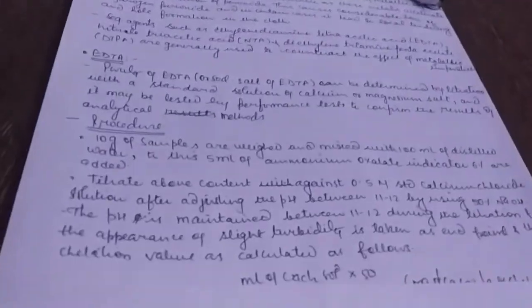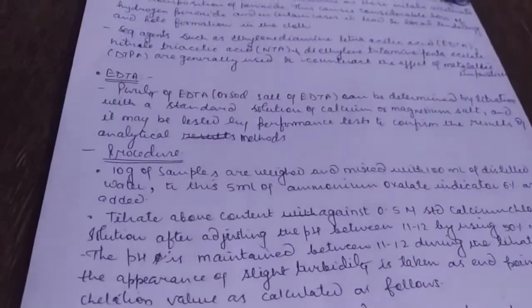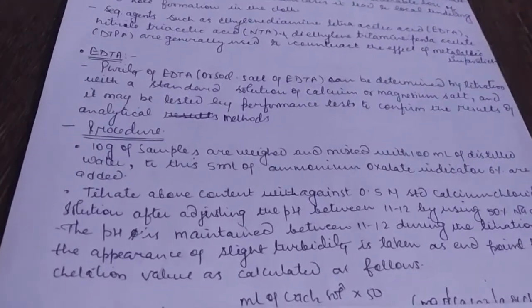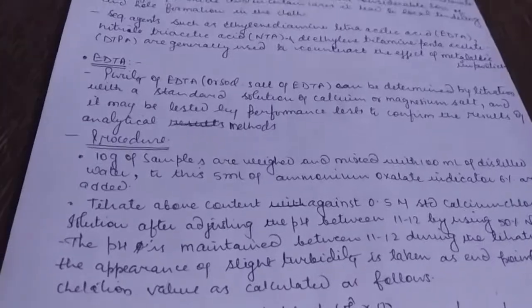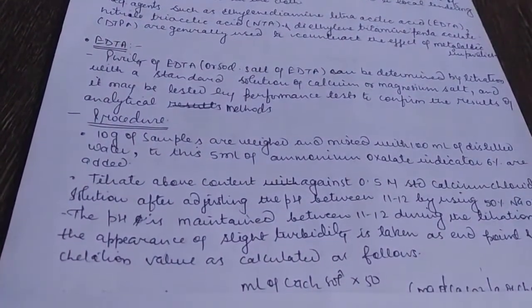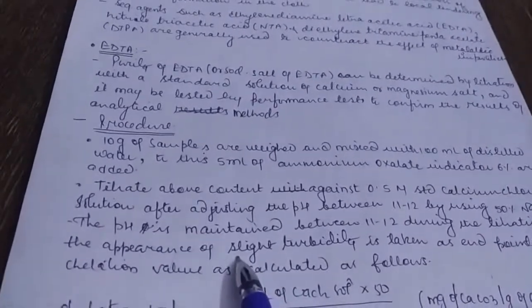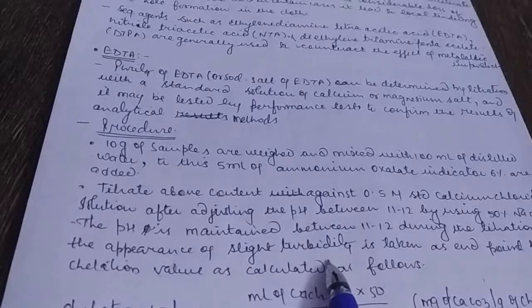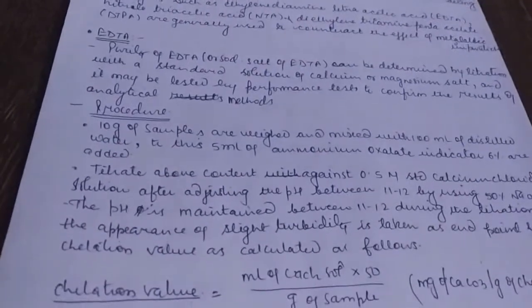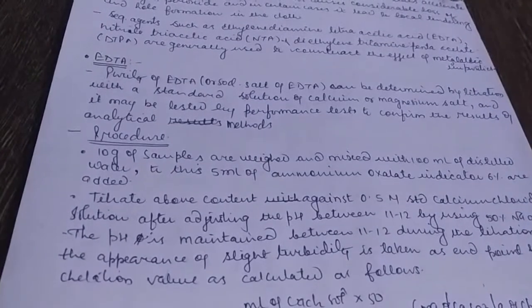First you should carefully identify the end point, where the titration should be stopped and we can say the titration is completed. That is, the solution turns turbid. So you should titrate until the solution turns slightly turbid, and then note the volume of calcium chloride consumed in this titration.